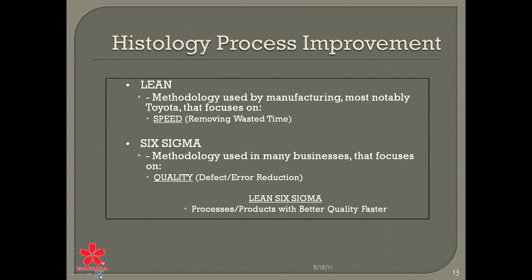So what do we do to improve this process? We went over some things and we came to the Lean and the Six Sigma procedures. Lean is all about speed, and Six Sigma has to do with quality. Lean is mostly from the Toyota Motor Production Company, and they have really put their workload in a much easier way.